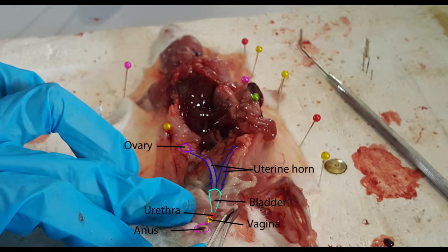In contrast, a simple uterus, like the kind found in humans, has a single chamber for the development of a single embryo. At the tips of the uterine horns are small lumpy glands called ovaries, which are connected to the uterine horns by oviducts. The urethra carries urine from the bladder to dispose of urine out of the body. The bladder stores urine and contracts to deliver urine through the urethra.